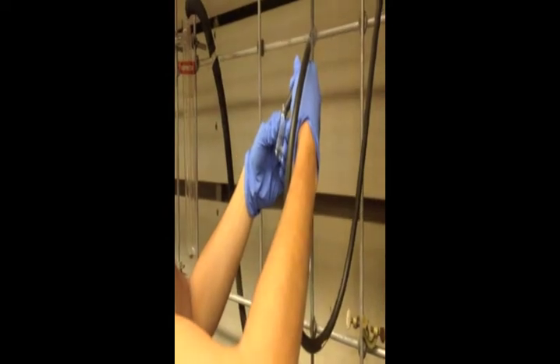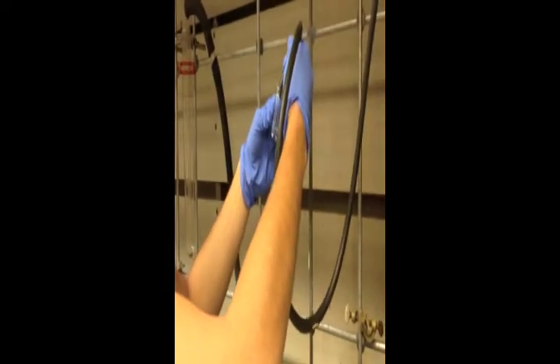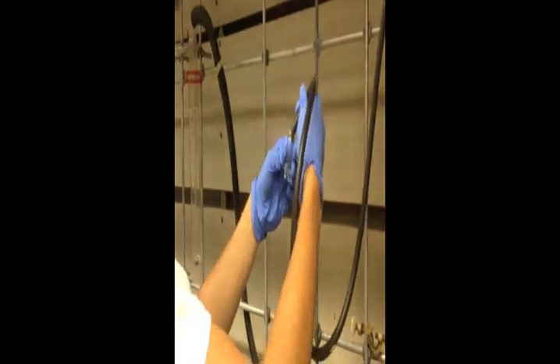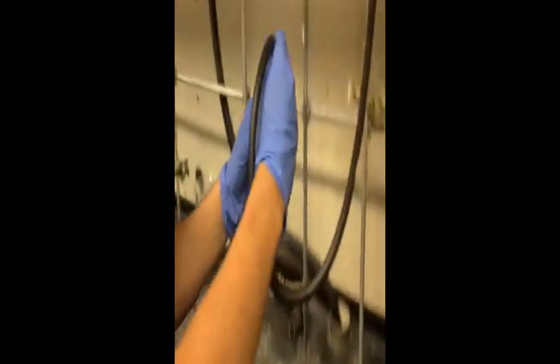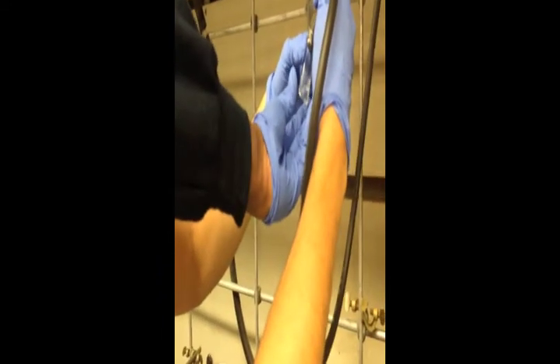The nitrogen gas introduces a lot of cold temperature. You want to heat up the vial; therefore, it allows the solvent to evaporate. So, hold it like this.